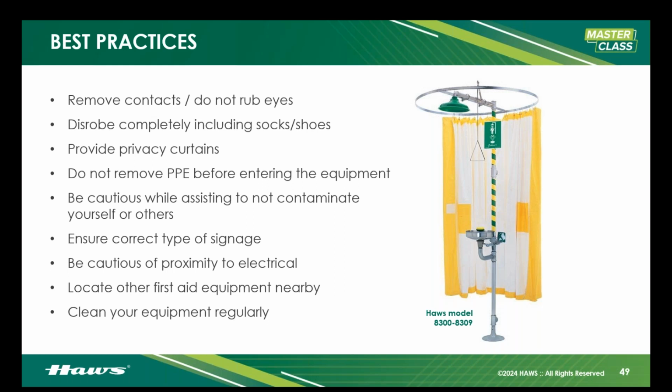So get disrobed. Provide privacy curtains with that. Just like you see on the right, give them some privacy. Maybe it's a booth, maybe it's a curtain like you see here, but that privacy can go a long way in ensuring that the concern about modesty isn't going to stop them from taking their first aid seriously. Do not remove PPE before entering the equipment. If your PPE was exposed, say you have goggles on and you've just been sprayed with something nasty, your eyes under the PPE are safe for now, okay?